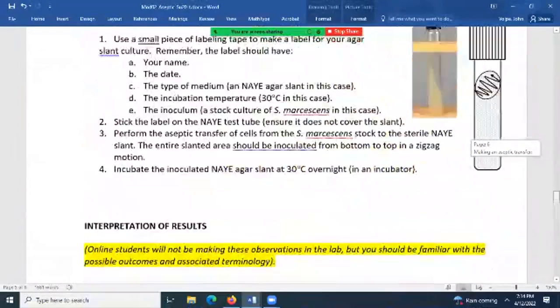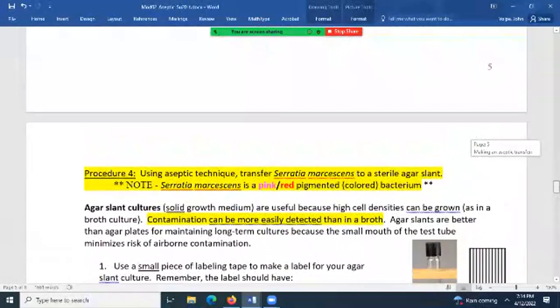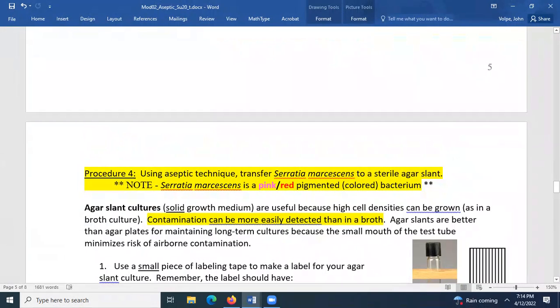An easy way to sterilize the forceps, and it gets them relatively clean, but not really sterile, meaning sterile has no microbes on it, you can put the forceps, clean forceps, obviously, in alcohol and then flame the alcohol. And that gets all of the vegetative microorganisms killed, but that will not kill an endospore.